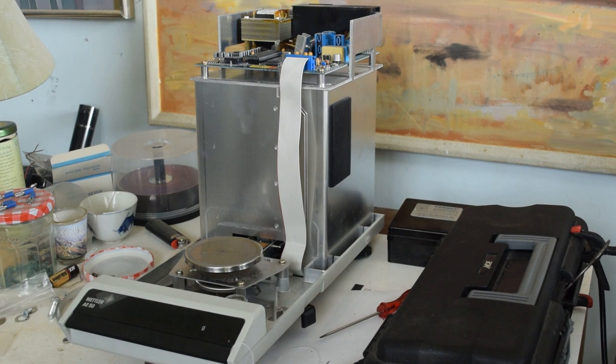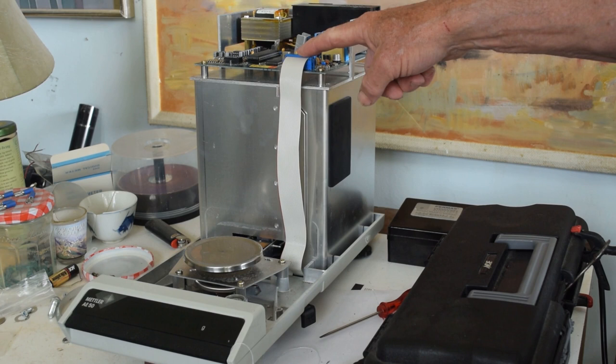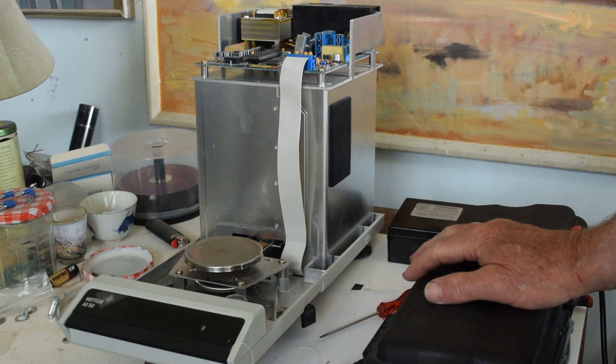Here we have the analytical balance with the cover off. The top board here is the power supply part, and this is the microprocessor, memory, and the analog parts.